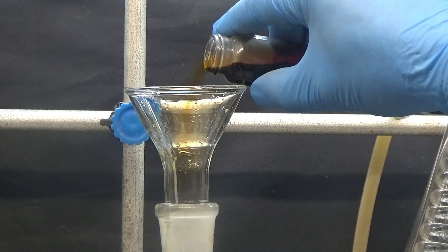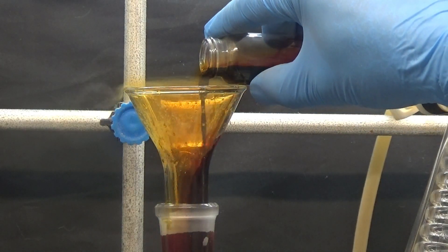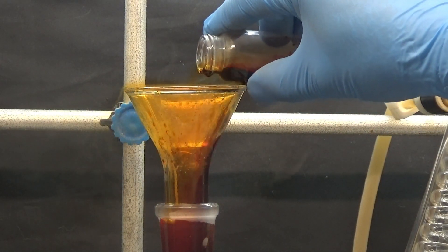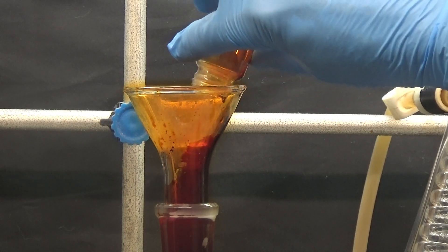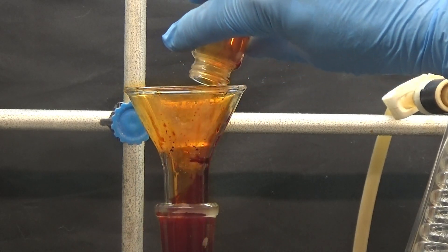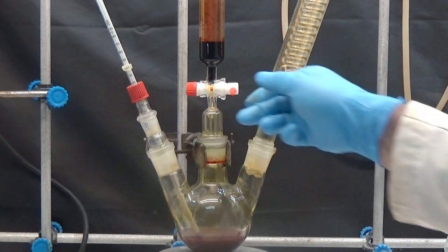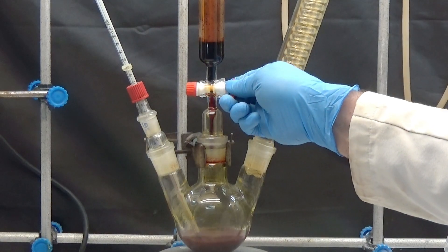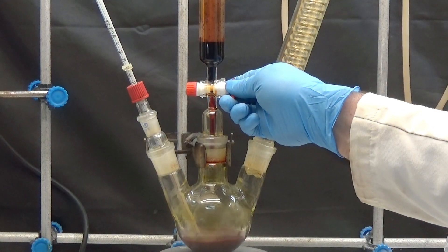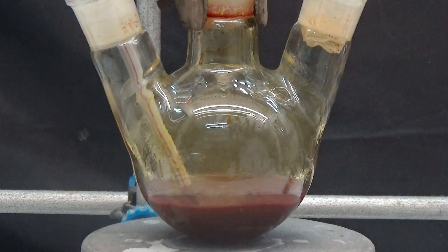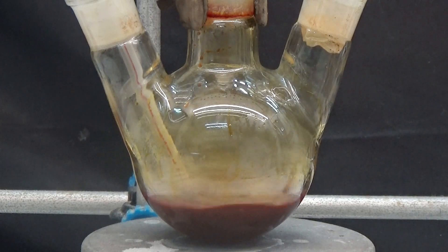We added bromine to the addition funnel. We connect the outlet of the condenser to the extraction to eliminate the hydrogen bromide vapors that are produced during the reaction. We add a small amount of bromine with stirring - the first vapors of hydrogen bromide have been observed.